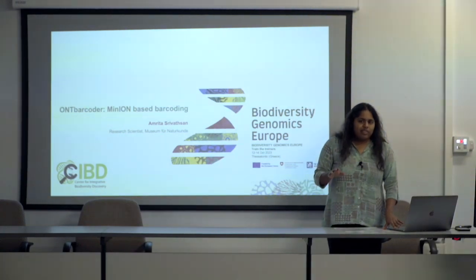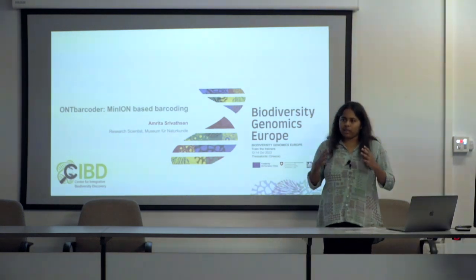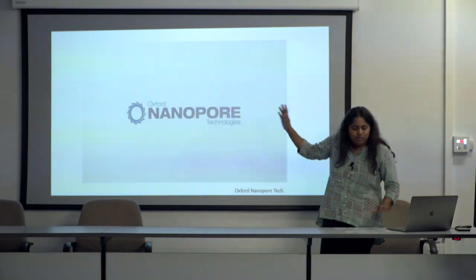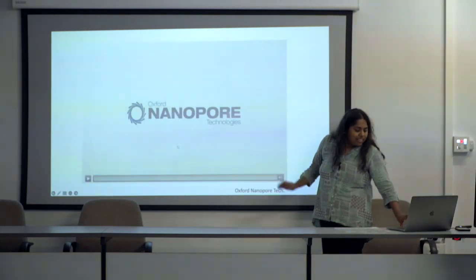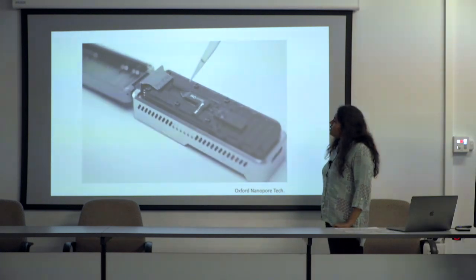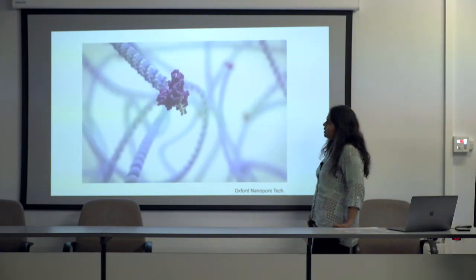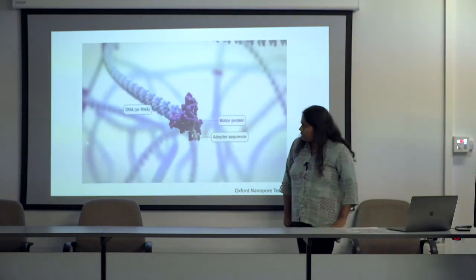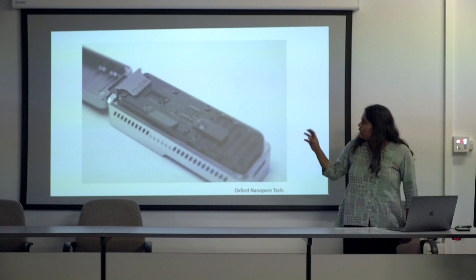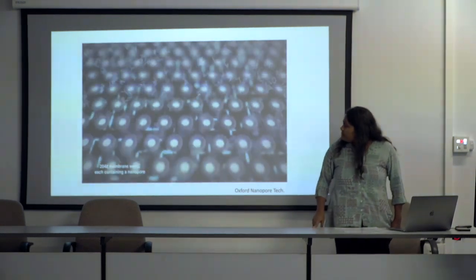So I thought, firstly, since yesterday a lot of the molecular steps were done with ONT, we can first look at ONT's video of what Nanopore is doing internally with the sequencer. So essentially, when the library is loaded, you have a DNA molecule going onto the flow cell, and then during the library preparation, you are attaching a protein molecule that tethers onto the flow cell.